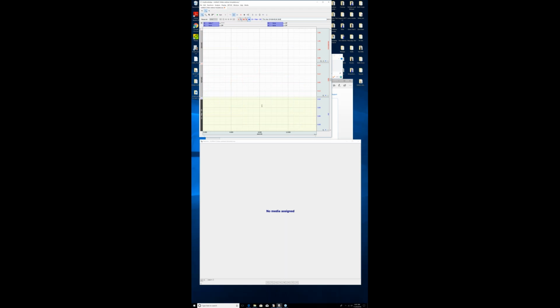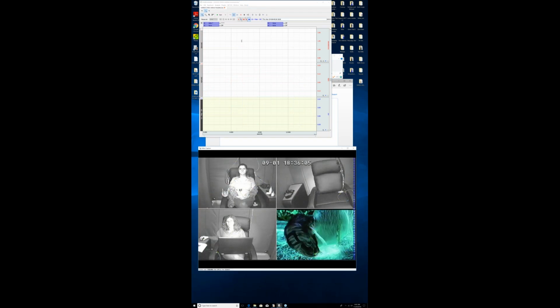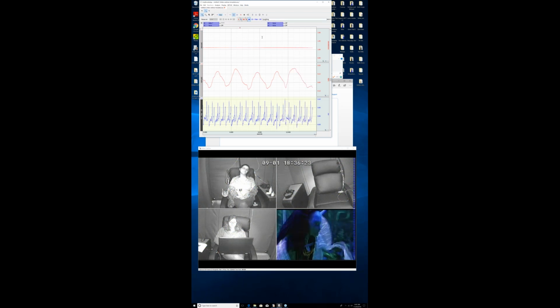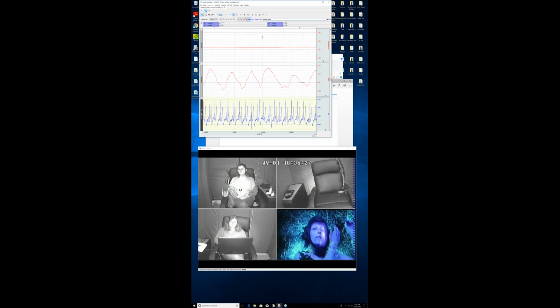So now when we come in, close this, I'm going to rewind everything back to the beginning. So we're now back at time point 0. I'm going to close this window out. I'm going to open up the capture viewer. So now we're back to live. If I hit start, now recording, and if I hit F1, you can see there's a little red diamond that's being placed up above, and it's marking it with coughing. And come in with F2, looked away, and we can close those out.